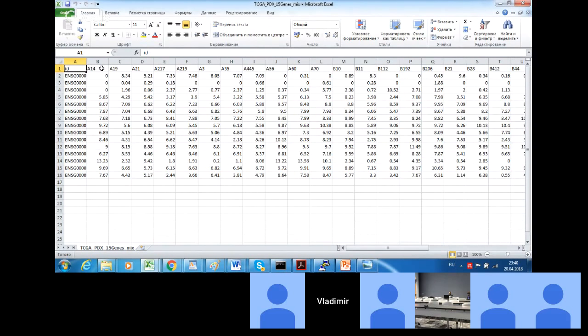So we do not need to hypothesize which group is a human group and which group is a mice group, but we need to try to divide these samples into two groups, humans versus mice, knowing nothing more about the biology and about the clinical features behind this data set.